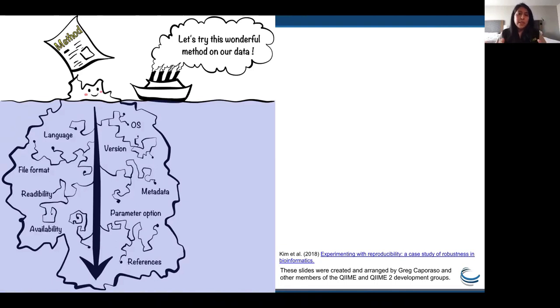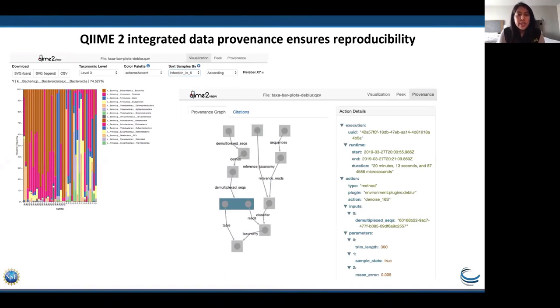That's one thing you have to keep in the back of your mind as you go through this data analysis. I'm showing an example here of a data set that was recently published. It's doable as long as whoever's publishing the data set gives you all that information. This is a quick screenshot on the left, showing a visualization file through QIIME, a taxa bar plot. You have samples listed in individual bars, broken down by what was taxonomically assigned. If you look at the top within this zipped data file, there's a provenance, which will show you what actually occurred in your step.